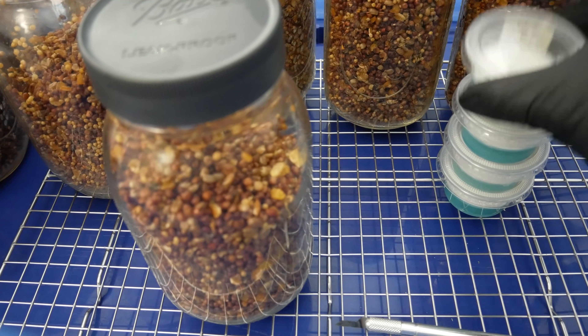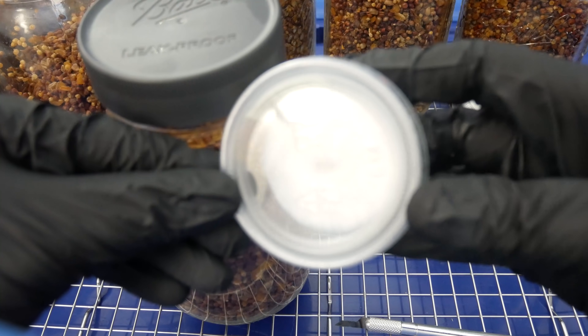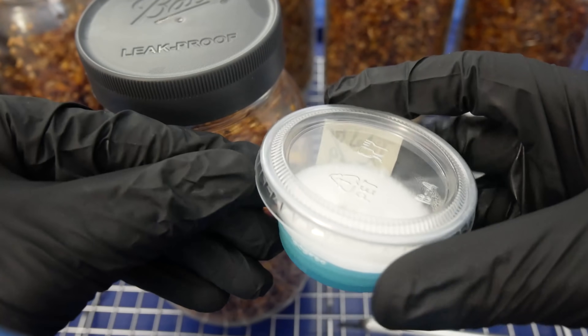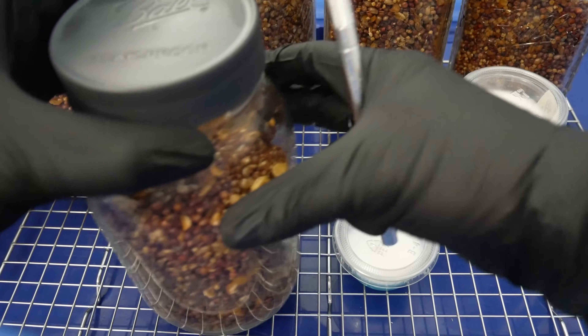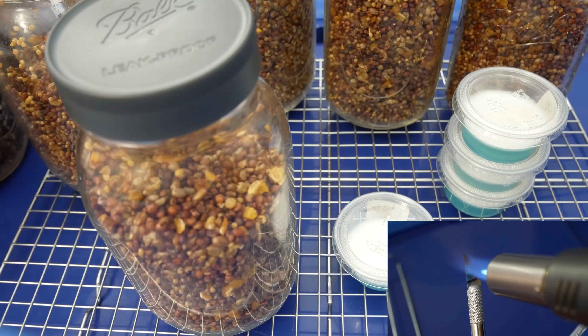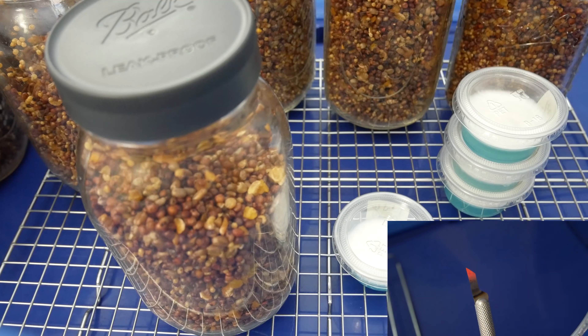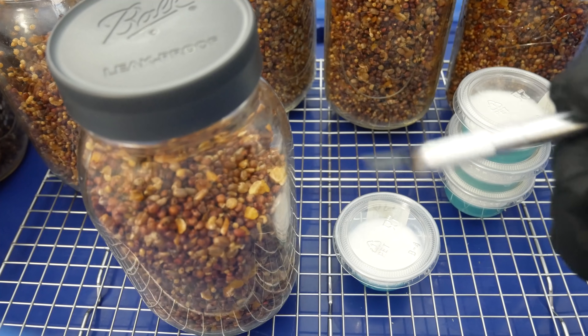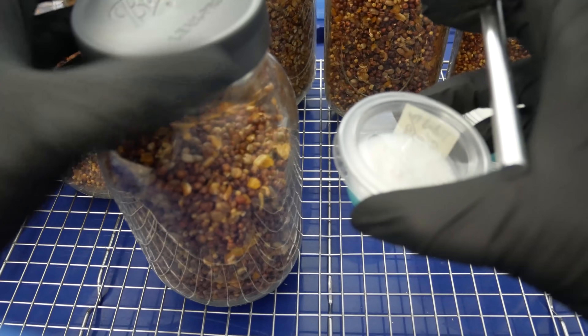Grain jars will serve the same purpose. The grains will provide plenty of nutrients for mycelium to feed off of and colonize as it becomes stronger. Here you can see my fully colonized agar cups — they're ready to go. I like to use usually one whole cup per quart jar. You can use more or less; depending on the amount that you use will determine how quickly your jars will colonize.